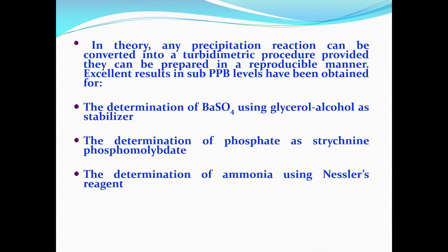For some of them I am listing below here, that is determination of barium sulfate using glycerol alcohol as a stabilizer. Now, you will be surprised how many times we do the determination of sulfate in water. The presence of sulfate in drinking water is a subject of regulation and standards, effluent standards.